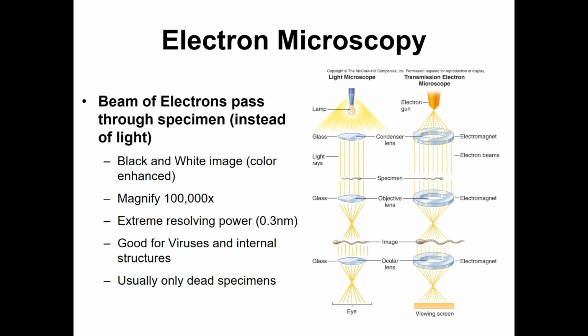All right, so let's talk electron microscopes. These are daunting tools that produce some of our most vibrant images of very, very small objects. Now, while electron microscopes are very powerful and many of them take up an entire room, they actually work on principles nearly identical to your light microscopes, and I can show you. So, electron microscopes don't utilize a light bulb. They utilize an electron gun. Light bulbs produce beams of photons. Electron guns produce beams of electrons.